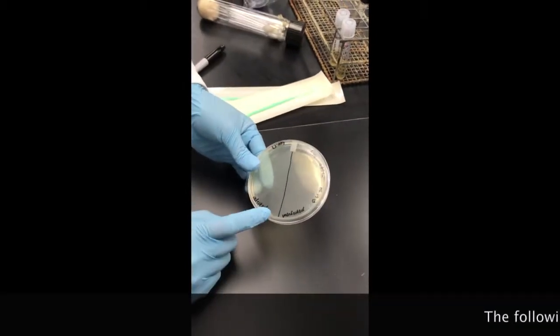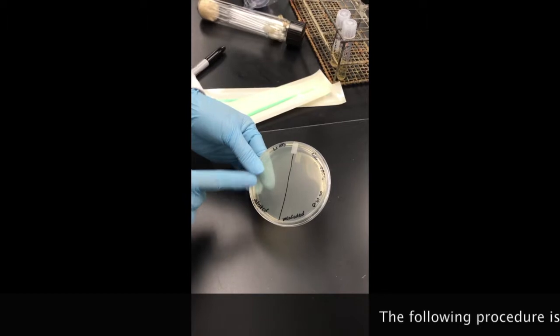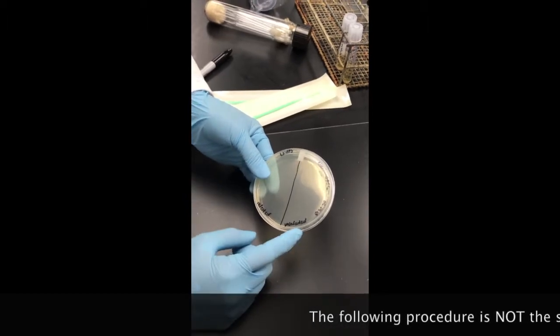So with your TSA plate, you're going to divide it in half, and you're going to label one side with infected and the other side with uninfected.